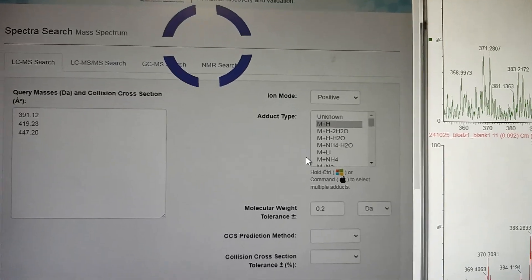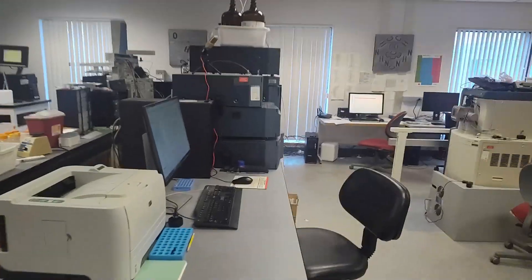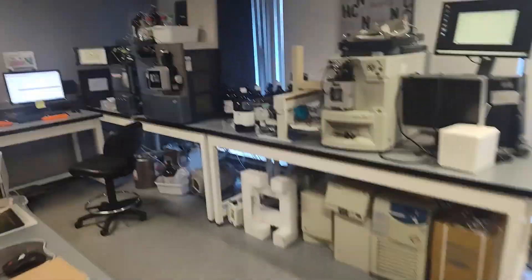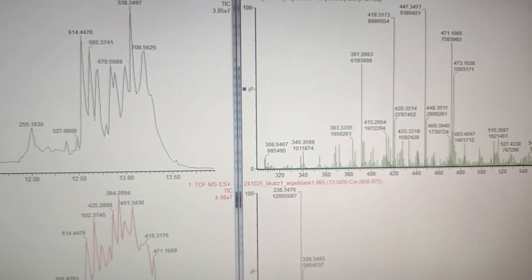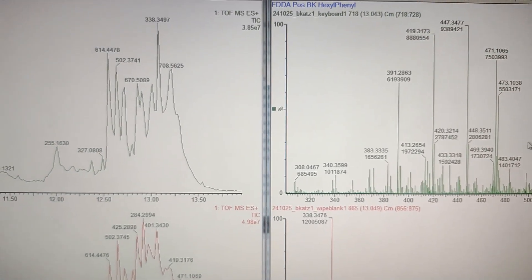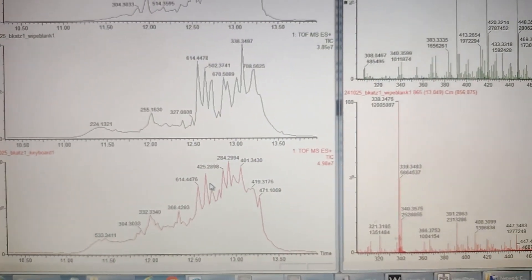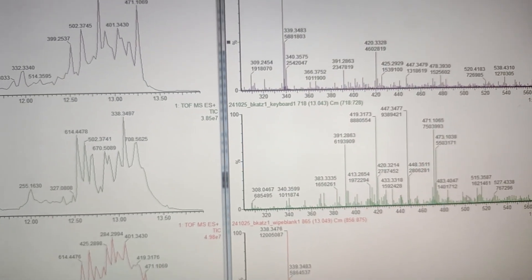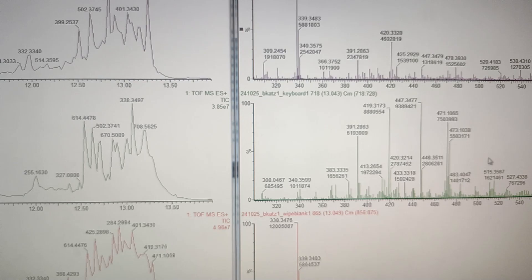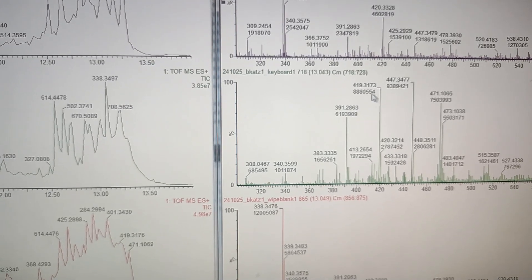I tried an HMDB search with a lot of error because this is a low-res instrument — protonated masses 391, 419, 447 — but the low-res data was not enough. Had to transition to the high-res Zevo Q-TOF, untargeted, keyboard wipe, fast DDA method for fragmentation. There's the cluster of peaks I'm interested in. Looking at the blank wipes across the same region, none of these are in the blank — so these are the culprits. And they're all shifted by about 28 Da.